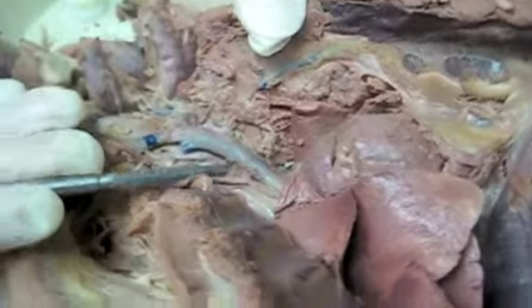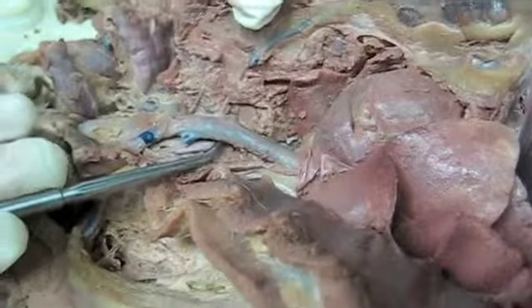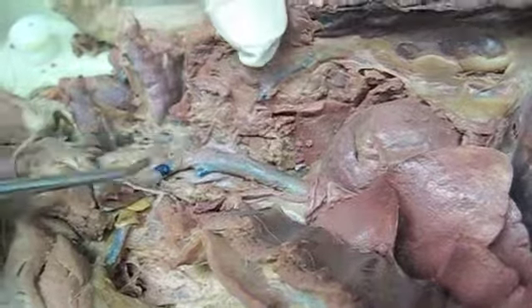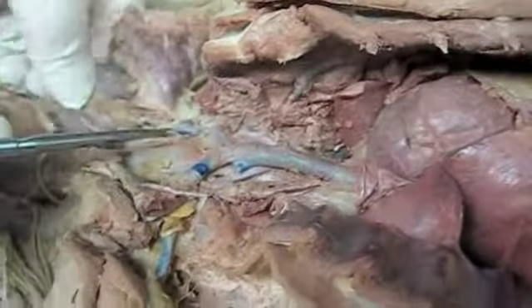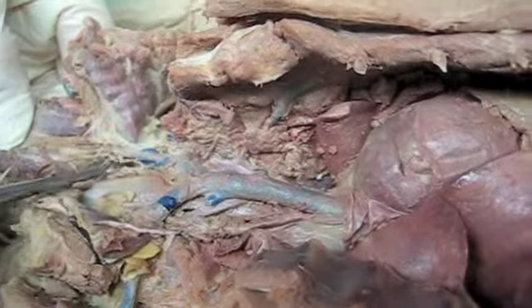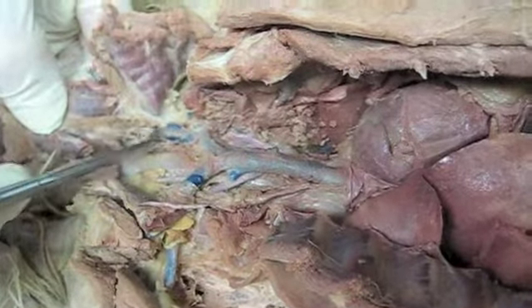So that one is the anterior vena cava. We'll do the veins first. It comes up here and splits into two big brachiocephalic veins. And then the brachiocephalic vein comes out here, and then the bigger continuation, which actually loses its injection over here, is the external jugular vein.